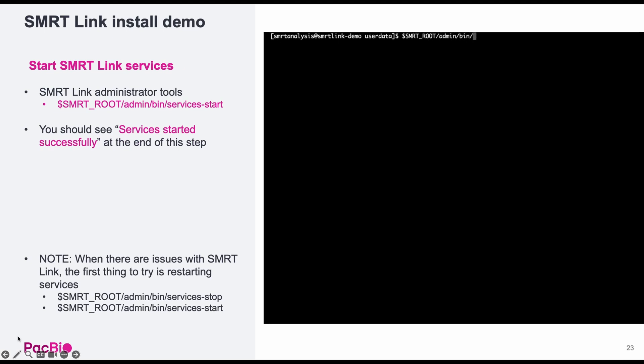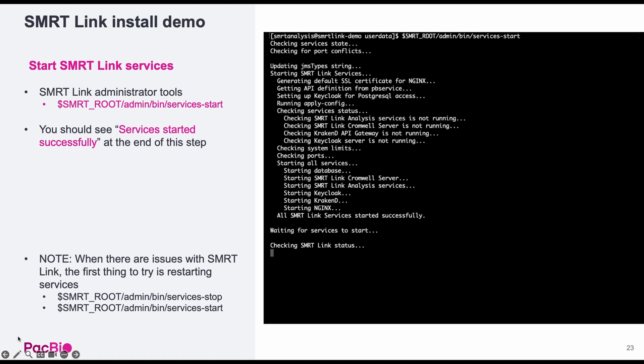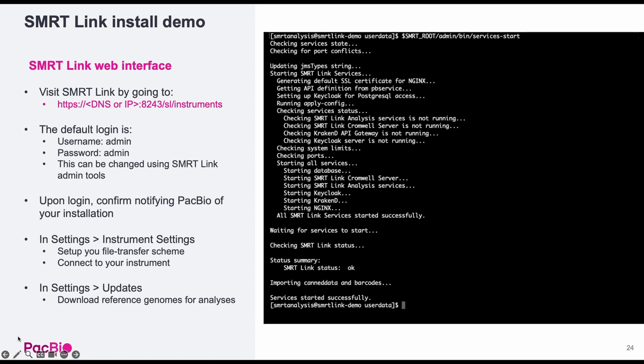Now we need to start SmartLink services using the SmartRoot admin bin services start command. At the end, you should see services started successfully.